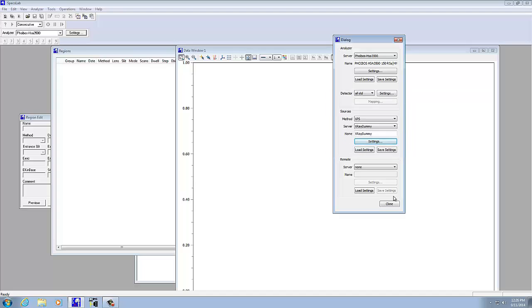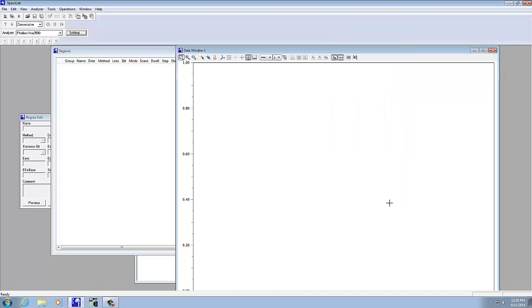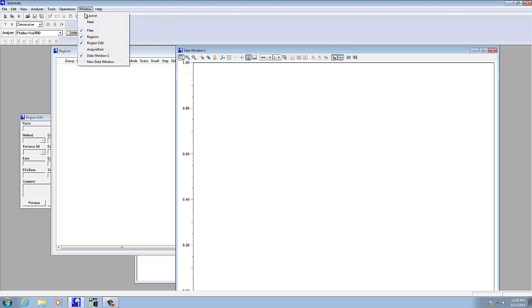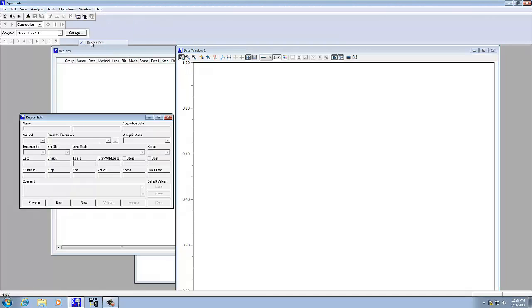Next thing we want to do is set up the regions. The region edit is where you put in the data, and it basically defines the scan parameters.